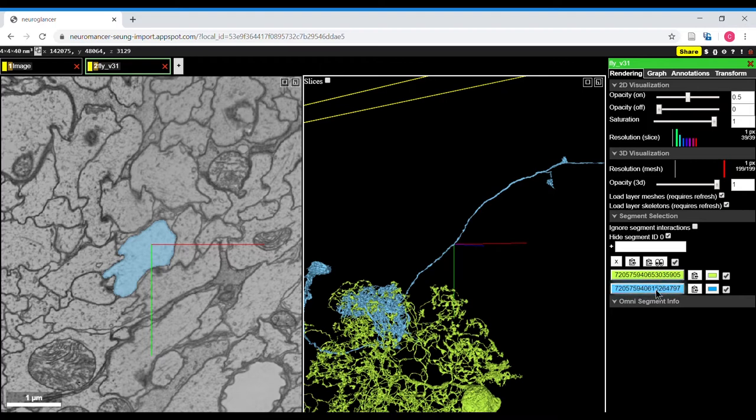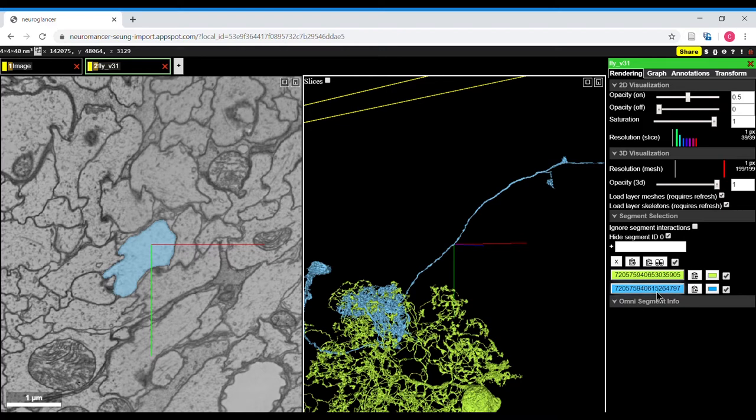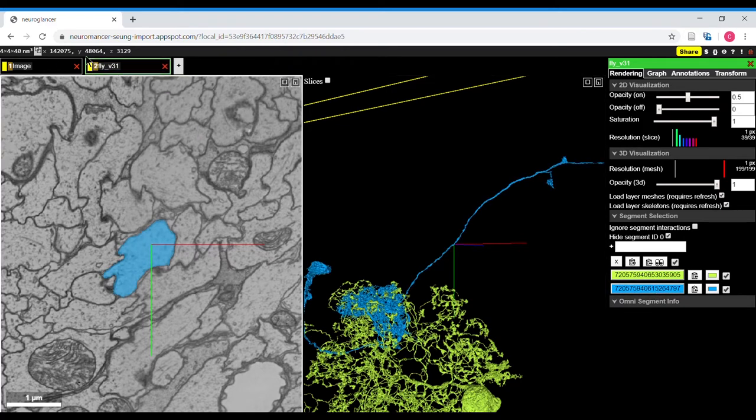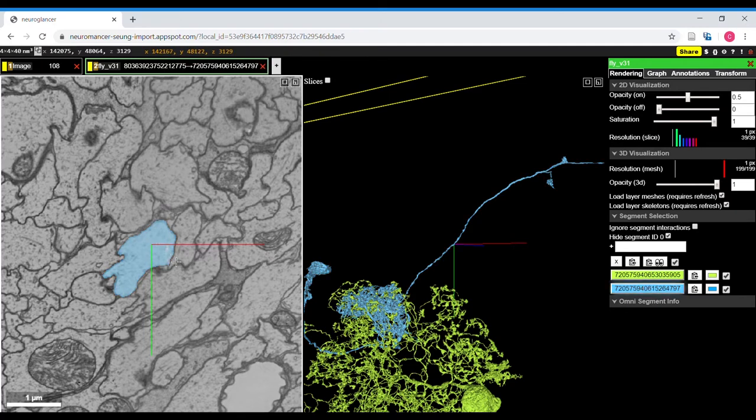So you can save this number in a spreadsheet that you're working in, but whenever any edits are made to that neuron, this number will change. So coordinates are the best way to save the most updated view of a neuron.